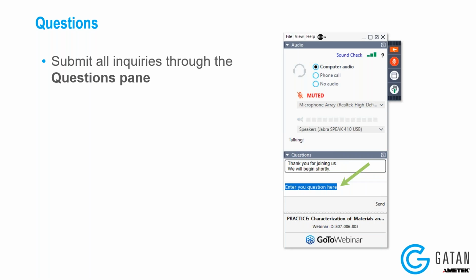Thanks, Ben. Can we do energy filtered diffraction on the Metro? No. The Metro camera can only be placed above the GIF. We don't put the camera at the end of the GIF to be able to do energy filtering.